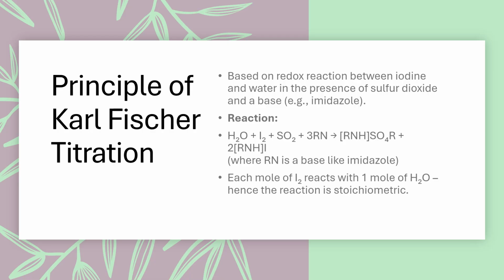Now an important point to note is that the reaction is stoichiometric. That means the quantities of reactants are in a fixed ratio. Specifically, 1 mole of iodine reacts with 1 mole of water. This 1:1 molar ratio is critical for accurate moisture calculation during the titration process, right?